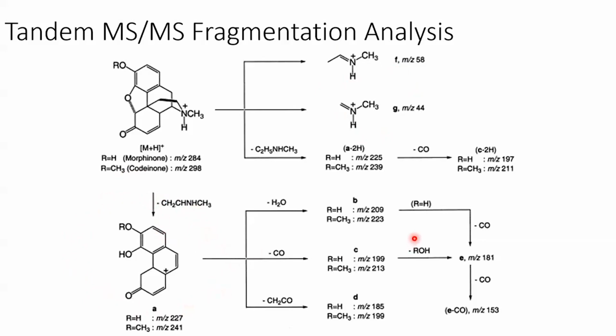Based on this fragment, you can get an additional 1, 2, 3, 4, 5 fragments. So basically your experiment's gone from 6 fragments total to 11 fragments total. It just makes your fragmentation patterns more detailed, and provided you can do this experiment on a known standard of your suspected illicit drug under the same conditions, you will be able to replicate these and match them all together. That will allow you to assign unambiguously what your unknown structure may be.